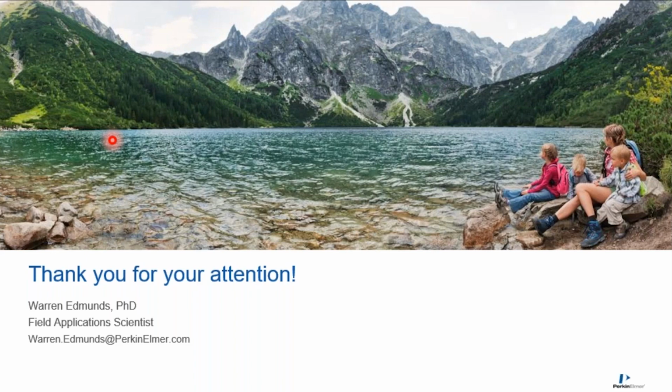No, you can put slurries or turbid samples in the TGA. That should not be any problem. What will happen likely with your analysis is you may see several weight loss events corresponding to whatever your liquid is. And you may see another response corresponding to whatever the solid is. Excellent.